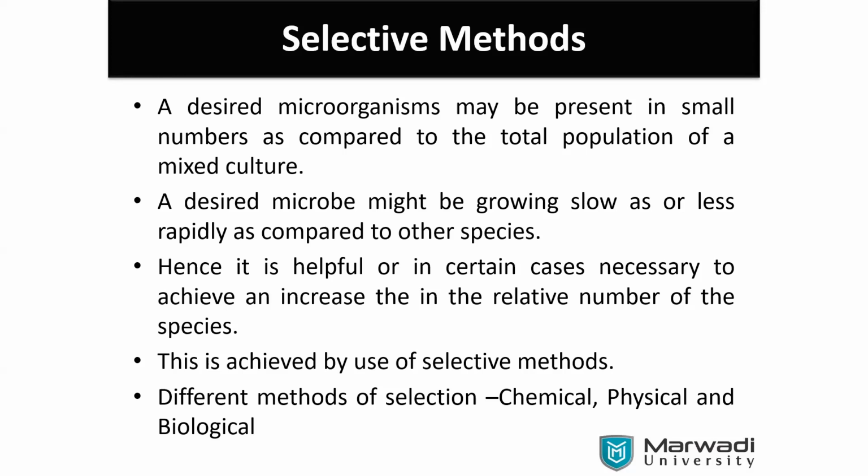I think we have kept the plates with certain other objects, maybe a reason. Yes, no growth, but very easy. There is no contamination. Okay, you can just pass it out. You may pass the plates.